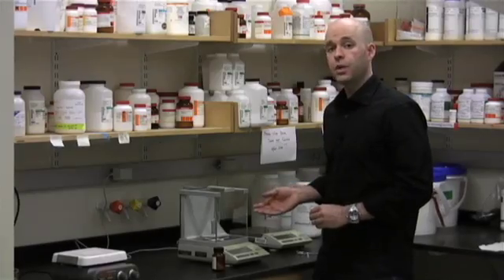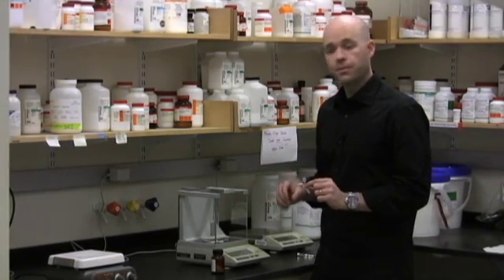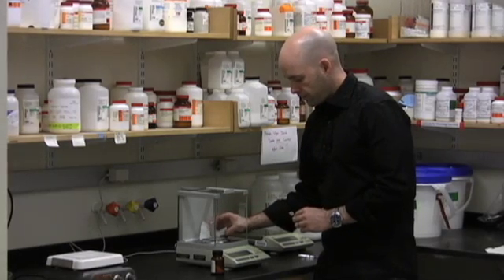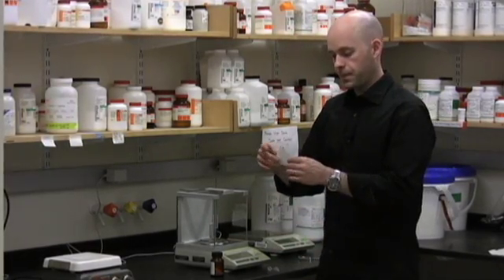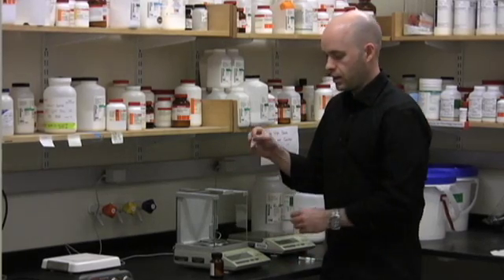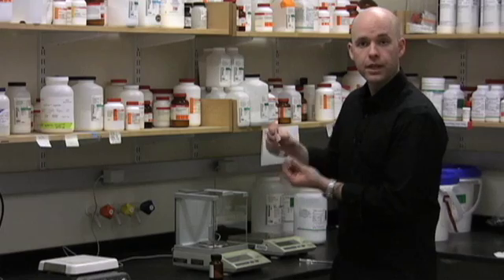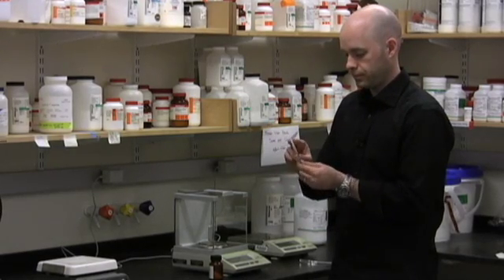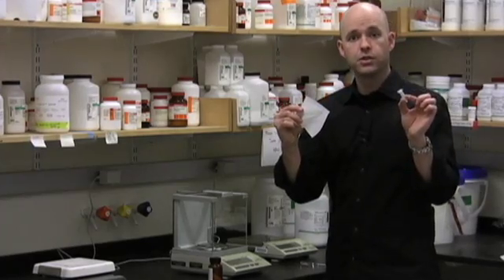The easiest way to transfer that one or two milligrams of solid into your tube is to now utilize that crease that we folded initially and essentially pour your solid into the tube. This way you transfer all of the powder into your tube.